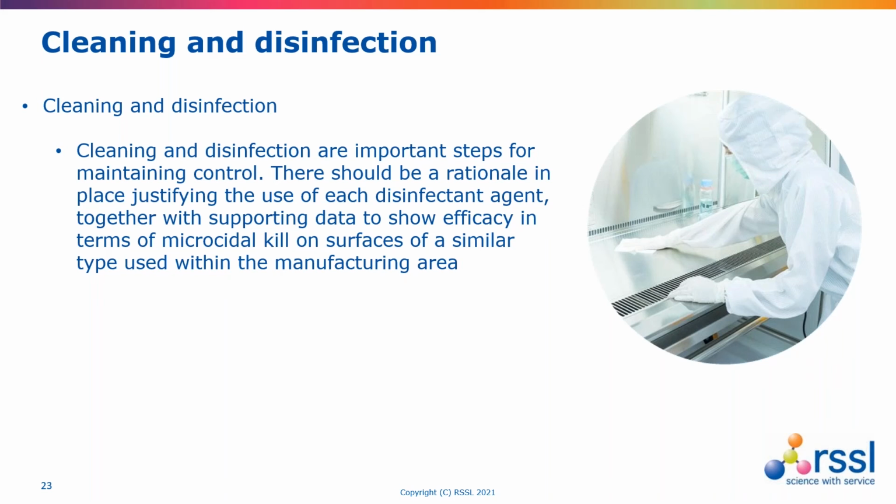Disinfection is about the inactivation or destruction of microorganisms, generally measured in terms of a log reduction. So we need to understand when we're going to clean, when we're going to disinfect, at what frequencies we would carry this out, and how that varies for different usages. And we also need to ensure that the disinfectants used have passed an efficacy test, particularly in relation to surfaces, and that we've evaluated the suitability of the cleaning and disinfection schedule against environmental monitoring data.